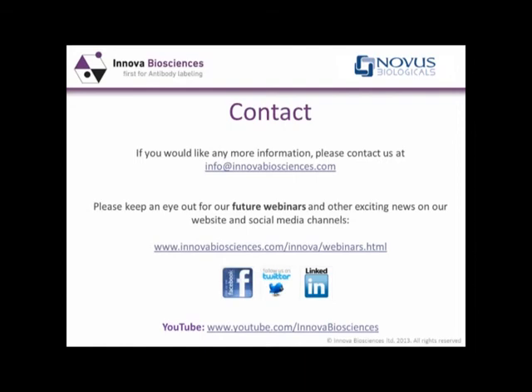Right, so the next question is, can we use this system to test DNA polymerases which generate pyrophosphate? Yeah, it's difficult to give a 100% guarantee on an enzyme we haven't tested ourselves, but one of the examples from the literature that I mentioned was a transferase enzyme which generated pyrophosphate from UTP. So there's no reason why this wouldn't work.